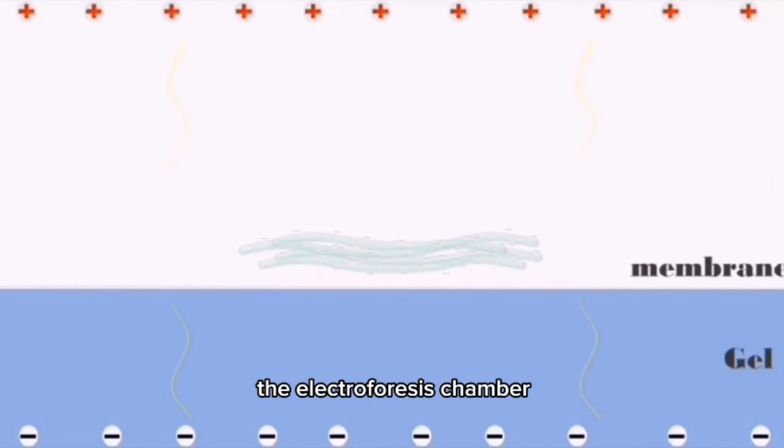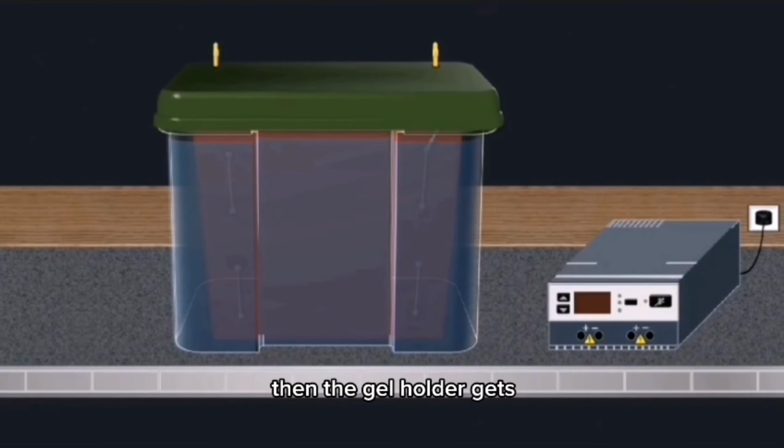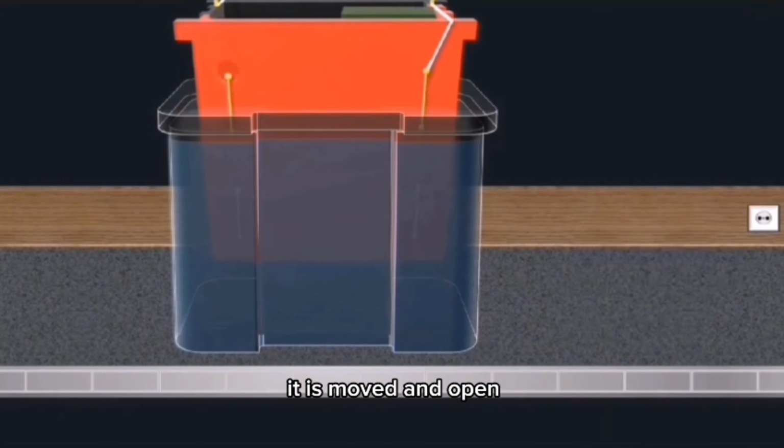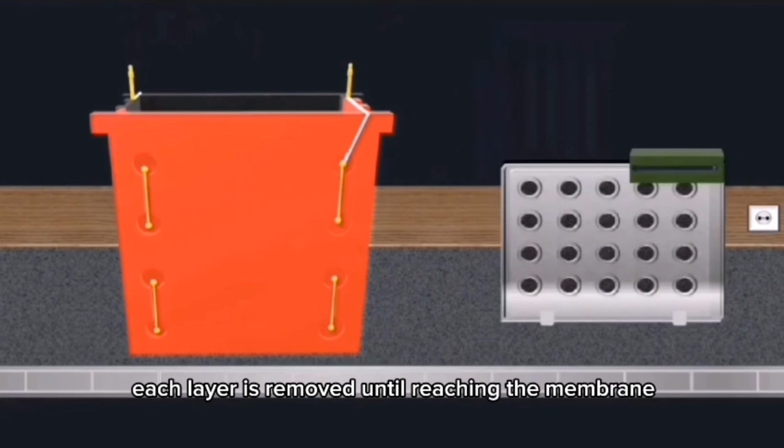When the run is complete, the electrophoresis chamber is disassembled and the inner module is removed. Then the gel holder cassette is removed and opened. Next, starting with the fiber pad, each layer is removed until reaching the membrane.